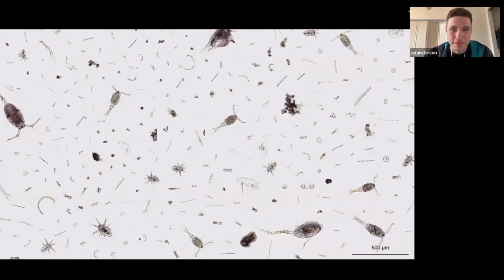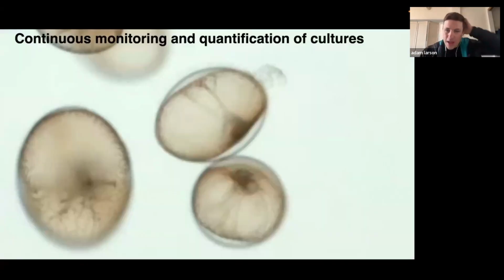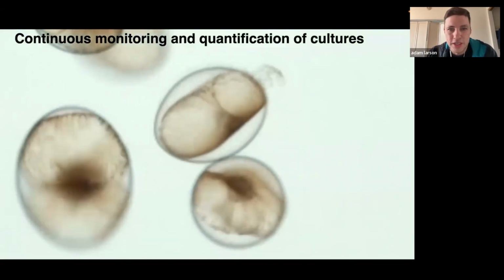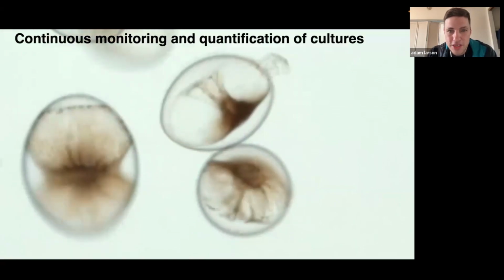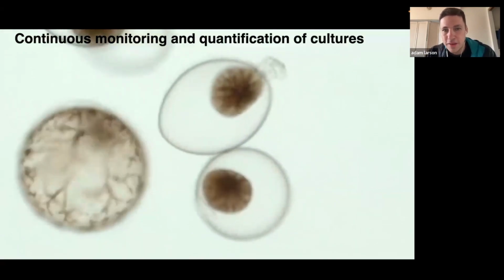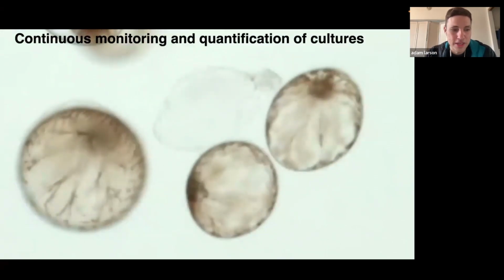So I'll start kind of selfishly with a plankton that I'm very interested in, which is this pyrocystis. And so there's another problem with plankton in that over time, plankton really change the way they look. So pyrocystis especially goes through many different changes in its life cycle. And it's really nice to know for me, because I was really interested in how this organism affects carbon sequestration, and it does this through this interesting life cycle and the way it migrates through the water. But the same species even looks very different depending on where it is in its life cycle.